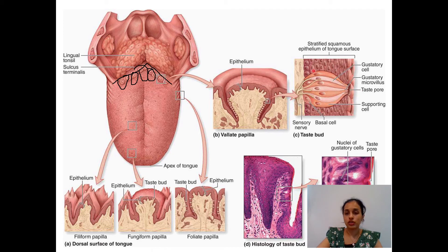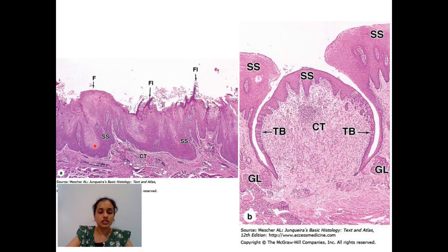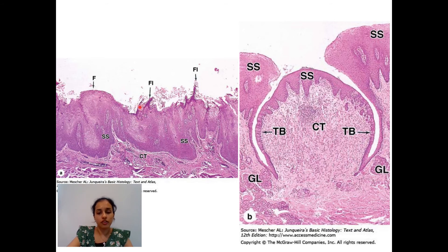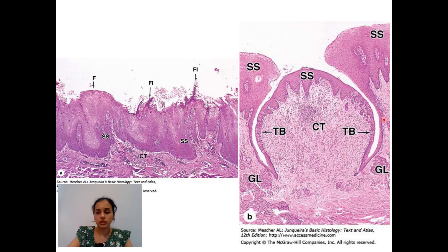This picture shows the structure of taste buds in higher magnification. In H&E staining, you can see different papillae: fungiform with a broad upper aspect, and filiform which is pointed or conical with keratin formation and stratified squamous epithelium. The circumvallate papillae picture shows stratified squamous epithelium, taste buds (TB), connective tissue (CT), and some salivary glands.